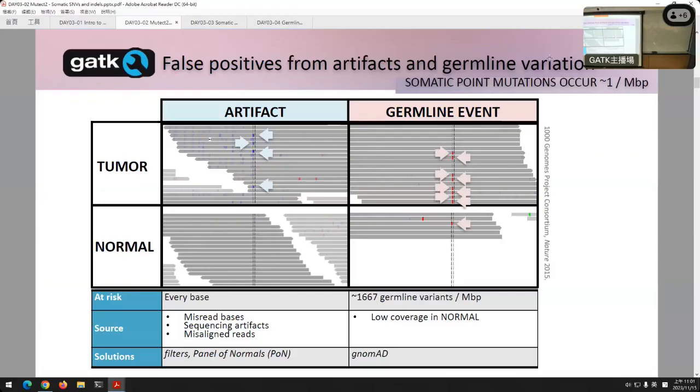There are still areas that are hard to align to. There are still going to be artifacts that we have in reading. Some even worse. But the thing is, there are also other classes of issues.